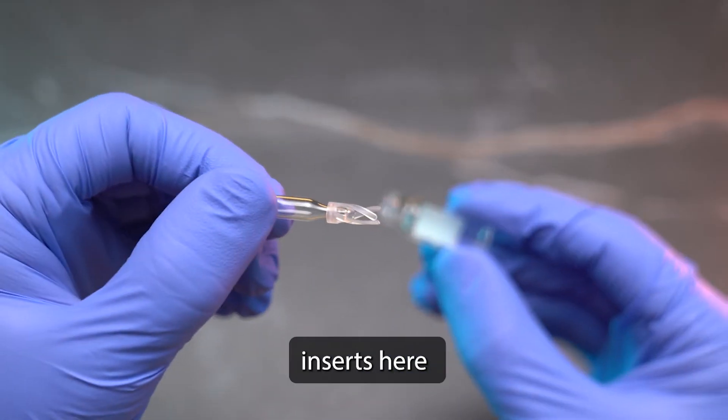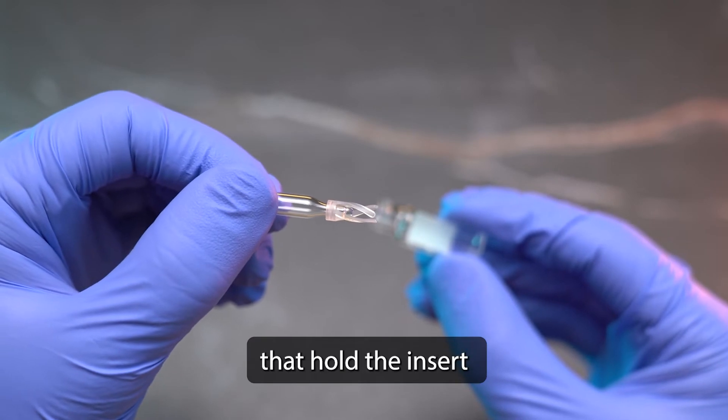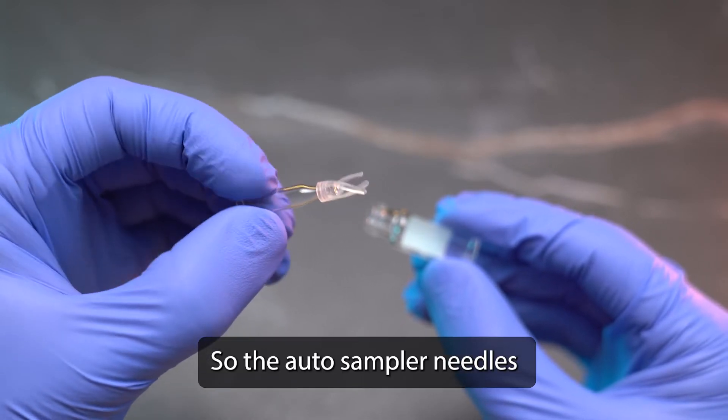The polyspring inserts here have rubber feet that hold the insert firmly in place, so the autosampler needle's path is not obstructed.